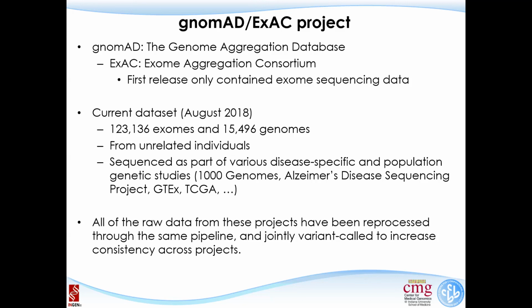By the end of the day, it becomes extremely useful because all the raw data from different projects has been reprocessed through the same pipeline, and the jointly called variants are being offered. So this can offer a very, very important resource for us to do a lot of studies.